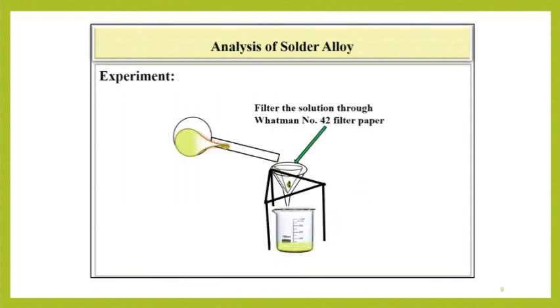Now, filter the solution through Whatman No. 42 filter paper. Collect the filtrate in a beaker. Insoluble SnO2 remains on the filter paper. The precipitate shows a tendency to adsorb metal ions like Pb2+, so it must be washed thoroughly. The precipitate is colloidal in nature and must be washed with an electrolyte like dilute HNO3 to avoid its peptization.